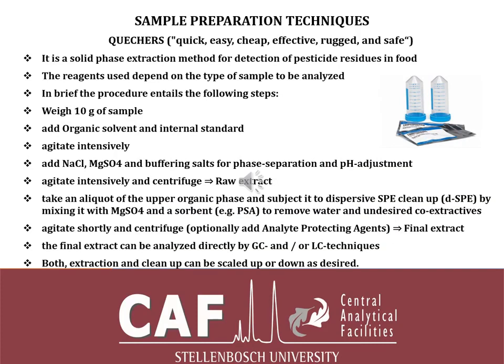Next sample prep technique that I want to talk about is the QuEChERS: quick, easy, cheap, effective, rugged, and safe. This form of sample prep is a solid phase extraction method for detection of pesticides in food. It's used a lot, mostly in the food industry for pesticide analysis. The reagents used depend on the type of sample to be analyzed.